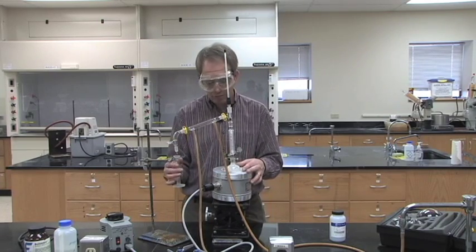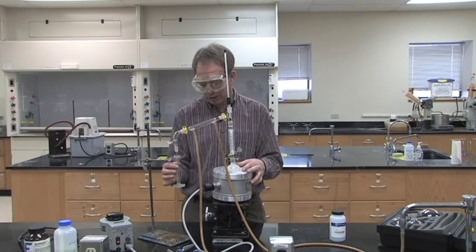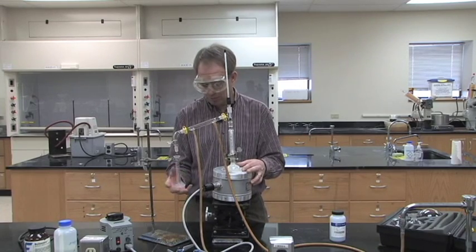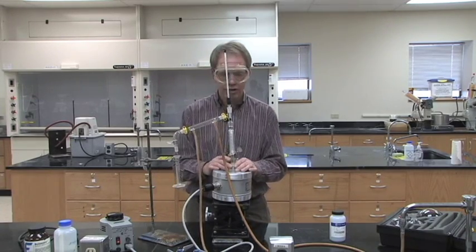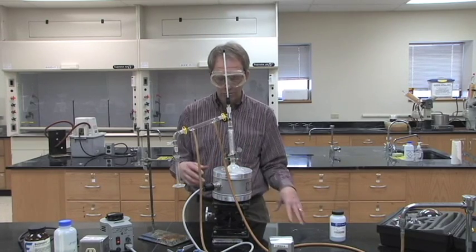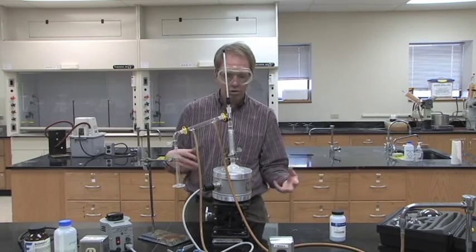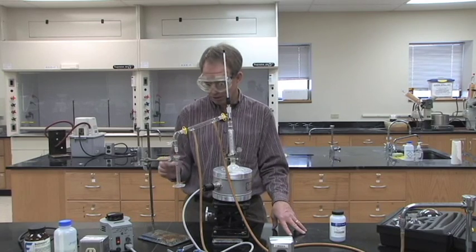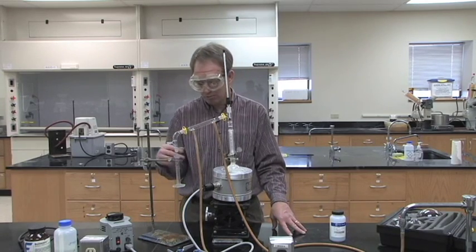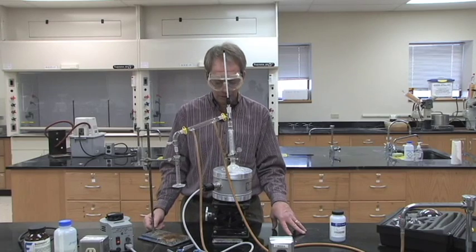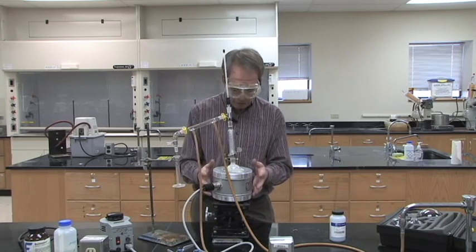We'll end up separating out in the first fraction a vast majority of the lower boiling compound, and then you'll dump that out and collect a second fraction. The second fraction will be a vast mix of both the lower and higher boiling compounds, and then the third fraction will be primarily all the higher boiling compound.